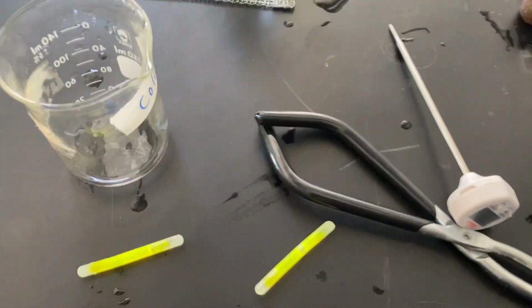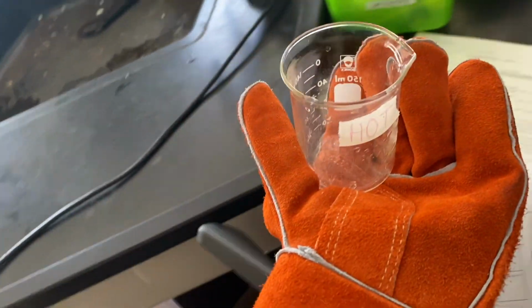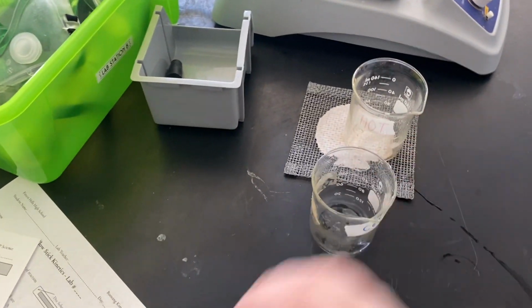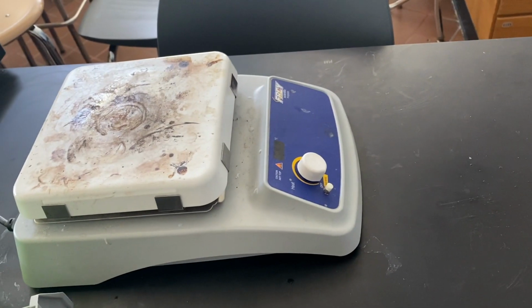For the hot one, you're going to want to use the orange glove because it is hot and we do not want you burning yourself. So grab that one, pour it out, and you could take your hot one and put it back on the hot plate, on the cooling rack. So that is your cleanup. Everything is back the way you found it. Your hot plate is off, and you are good to go.